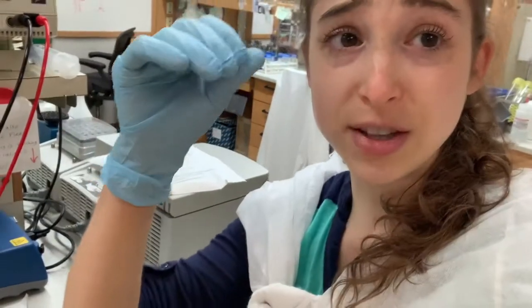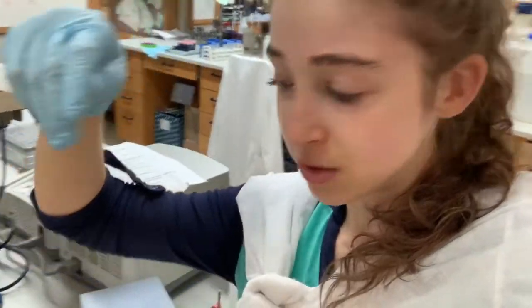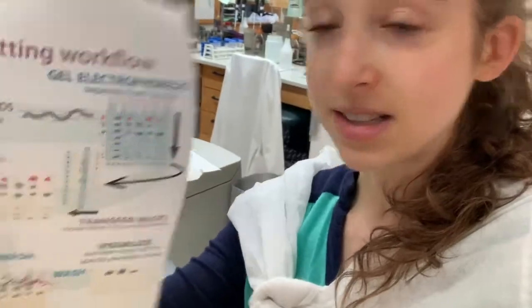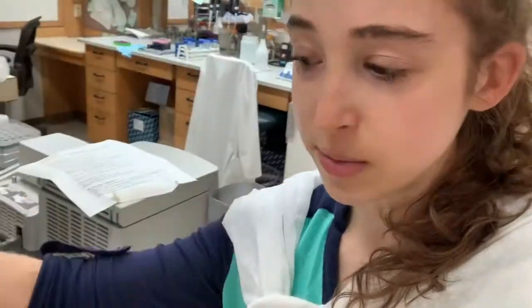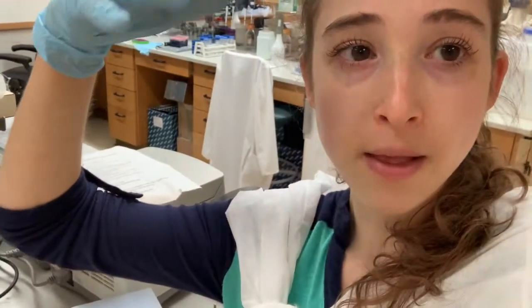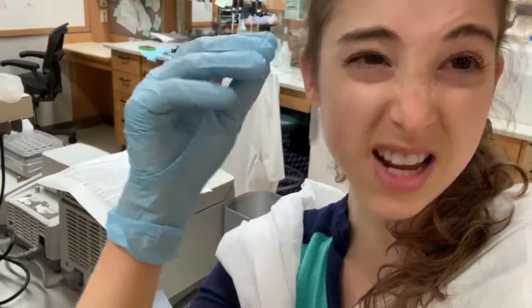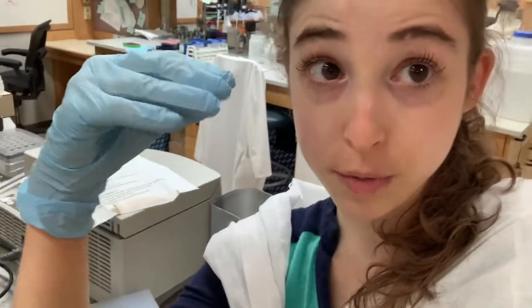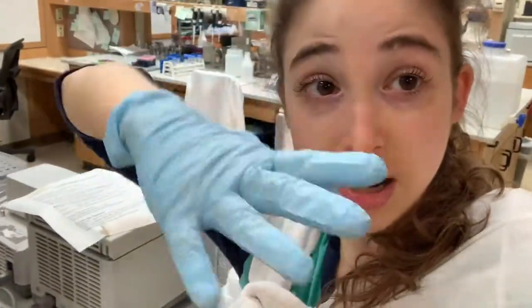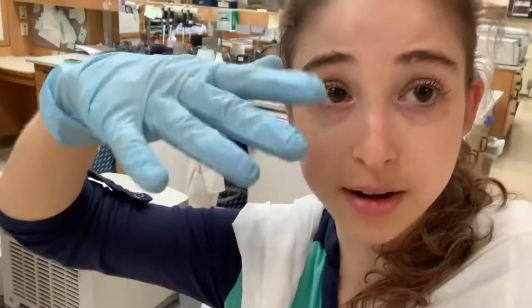An SDS page gel is basically where we take a little bit of a sample containing some proteins and run it through a gel mesh, and it's going to separate by size. We take the proteins, denature them — we unfold them — and heat them up and coat them in SDS, which is a detergent, kind of like an artificial soap. The heat and the SDS are going to unfold the protein.